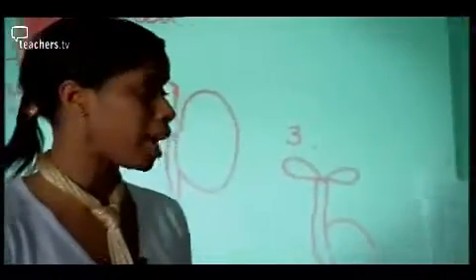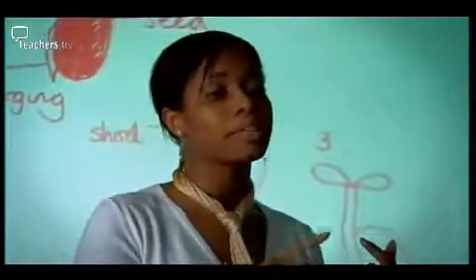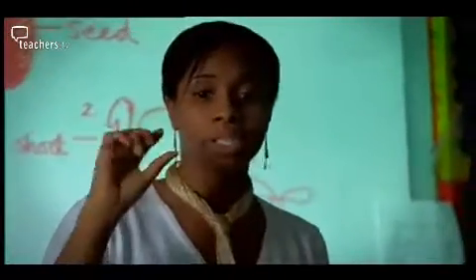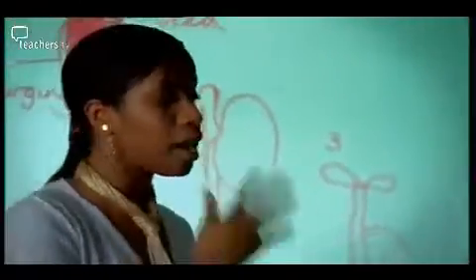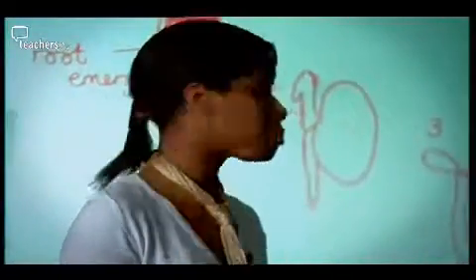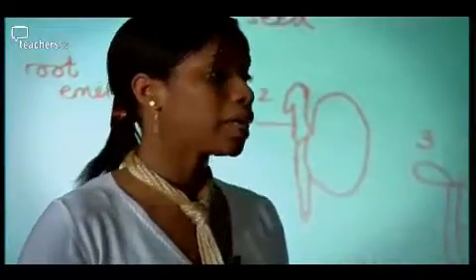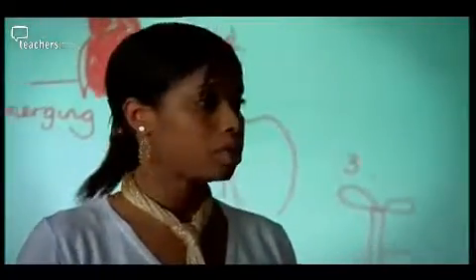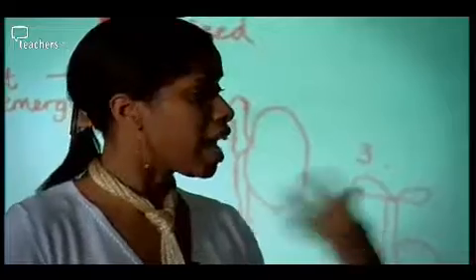So it has lots of capabilities. Remember, we can look at things more clearly, okay, using the different magnification and using the focus. We can use the time-lapse program, and also we can look at putting our pictures into a presentation. So, what did Avril and Ophelia think about the lessons?